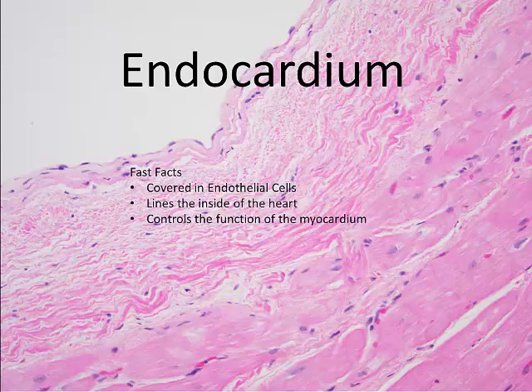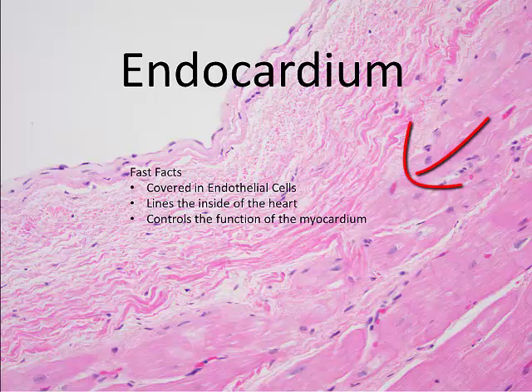Next is the endocardium. This layer is covered in endothelial cells on the luminal, or inside, surface and has connective tissue underneath, closer to the myocardium. You can see small blood vessels in this region.